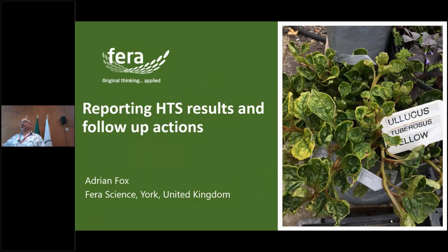So at that point, do you do a suite of ELISAs, PCRs, real-time PCRs, a bioassay, possibly use an electron microscope, by which time you've probably spent 6,000 or 7,000 euros on your diagnosis? Or do you do it on the high throughput sequencer, where we're currently turning them around for about 500 euros per sample? I know what the sensible way to go is. If you put it on a high throughput sequencer, you at least get a definitive answer in a controlled amount of time for a controlled cost.